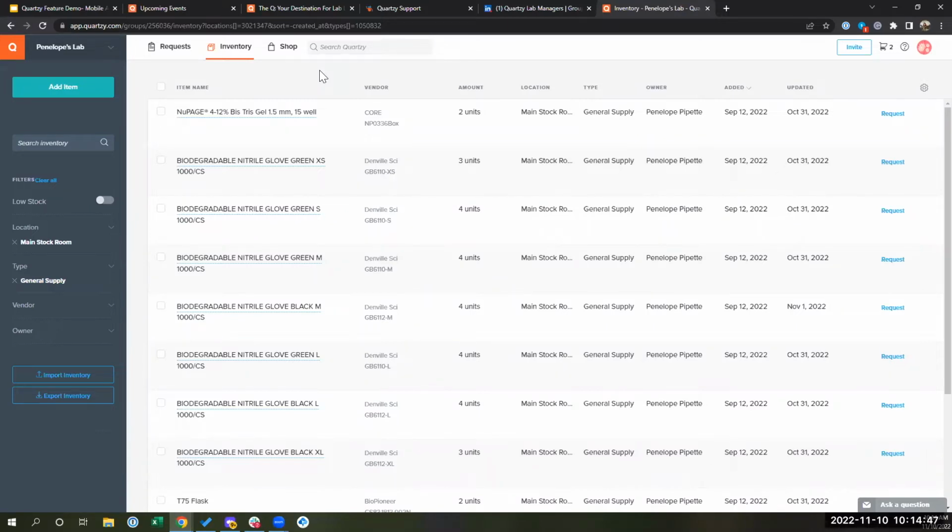It essentially puts the content into predefined tables that fit the 2x4 label. But you can print it, which means download it to Word, and it can be manipulated from there. It's just we can't guarantee it'll fit the various templates that are out there until we make predefined templates for the other sizes, if that makes sense. So, yes, sorry to jump in.